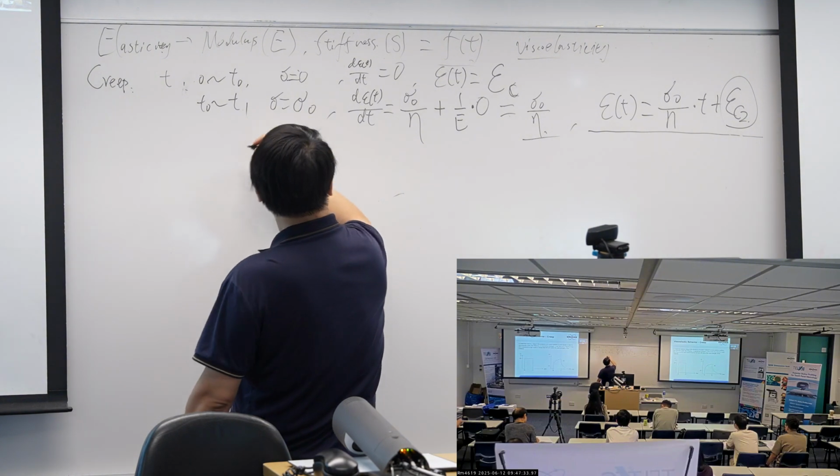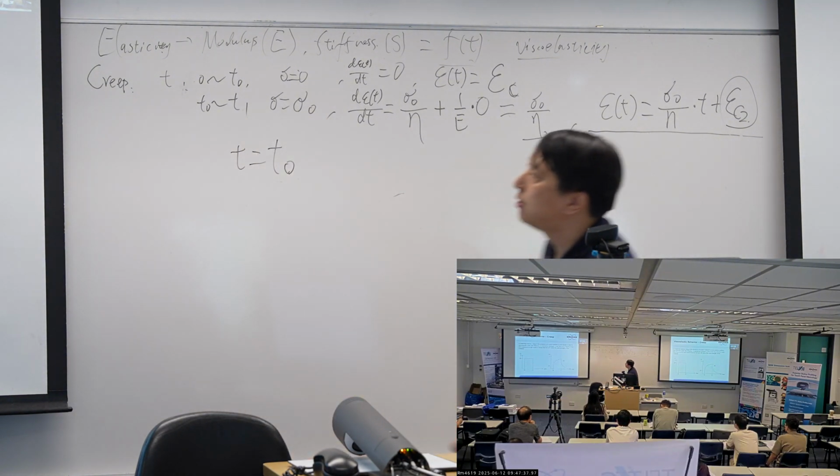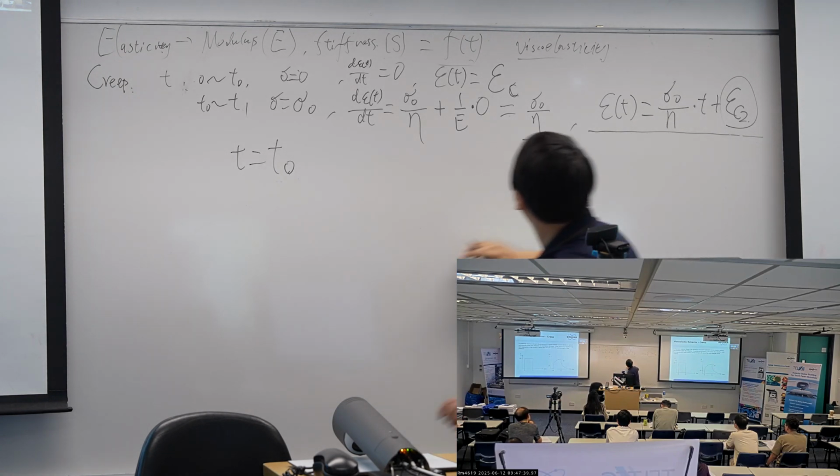So we can use t equals t0 as our condition.